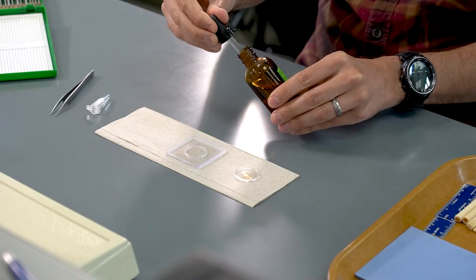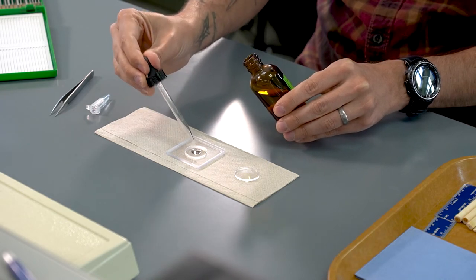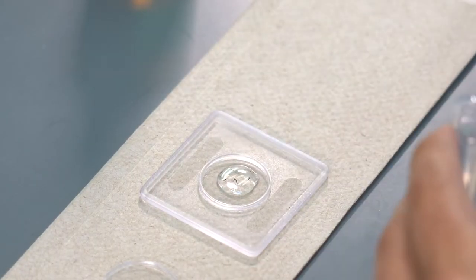Now that we've collected our thrips from our peony samples, we need to try to identify them. To do this, since they're very small, we need a high-powered microscope and we need to mount them on slides. The first step in this process is to put the thrips into a solution that will break down all of the soft tissues inside the body, leaving just the hard exoskeleton with all the characters that we need to identify them.